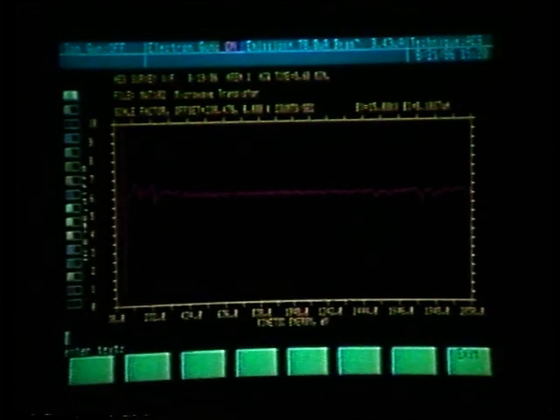The photo we would like to refer it to is the 5000X SEM photo which we took of the microwave transistor, which was photo 105. We can then enter the text: AREA, area number 1, photo 105.